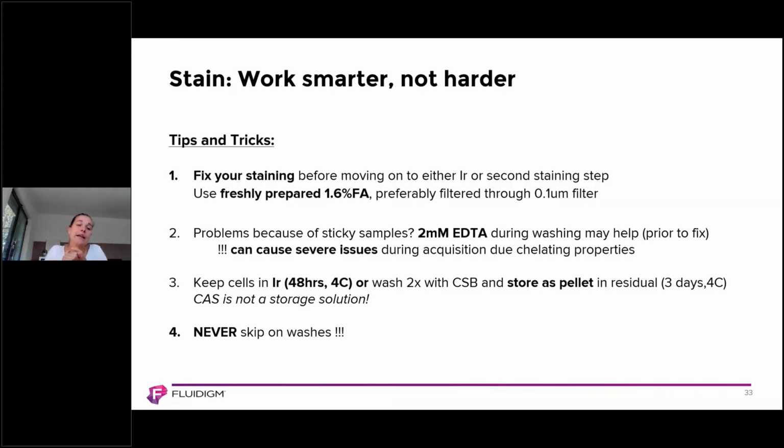And another thing, you can keep your cells in iridium perm-fix iridium at the end of your staining up to 48 hours maximum. And the day after or 2 days after, just wash your samples with the cell staining buffer and store them as a pellet. Like this, you will not have an explosion of your cells.